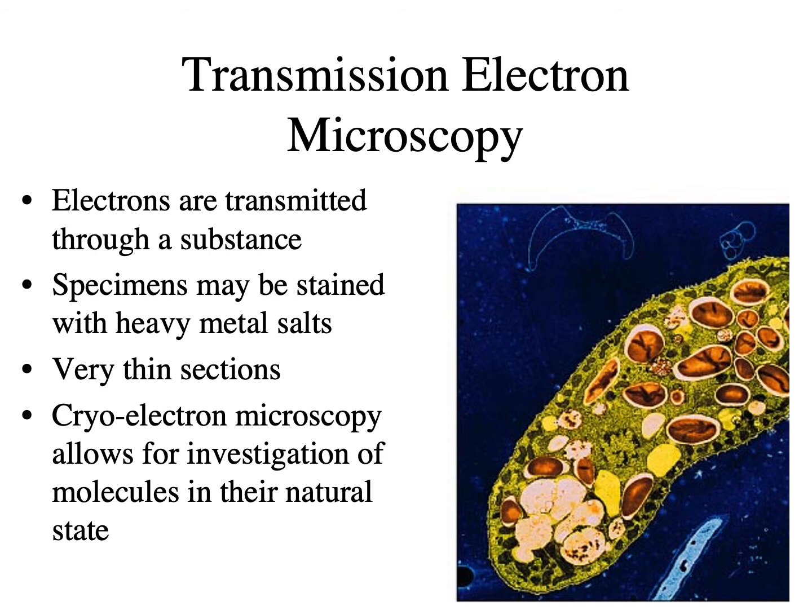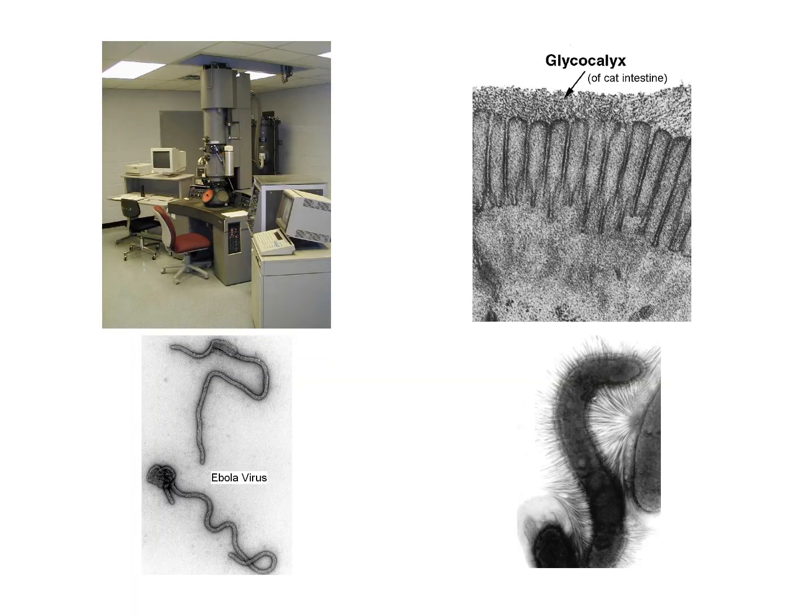It's super amazing resolution, really clear. And you can see all these things inside the paramecium that we haven't been able to see before. There's lots of little blobs. That is a classic way of viewing a transmission electron micrograph, or a picture from a transmission electron microscope. Usually we just abbreviate that TEM, but absolutely beautiful. The apparatus is pretty big. We don't have one at Mount Hood. PSU has a really fantastic electron microscope lab if you ever are interested in doing more microscopy.